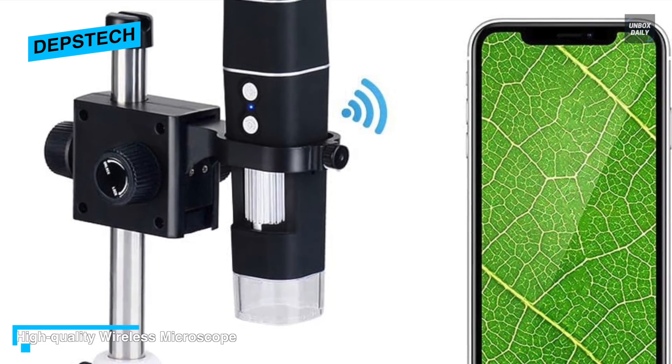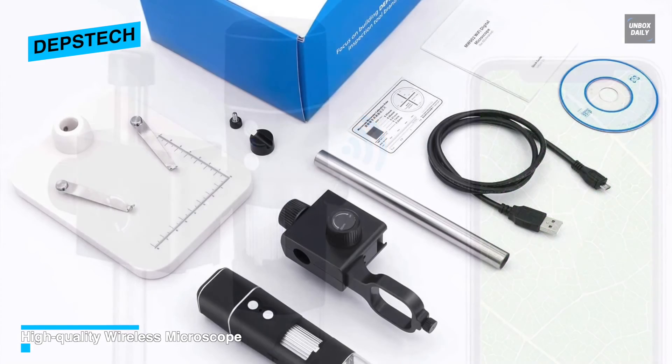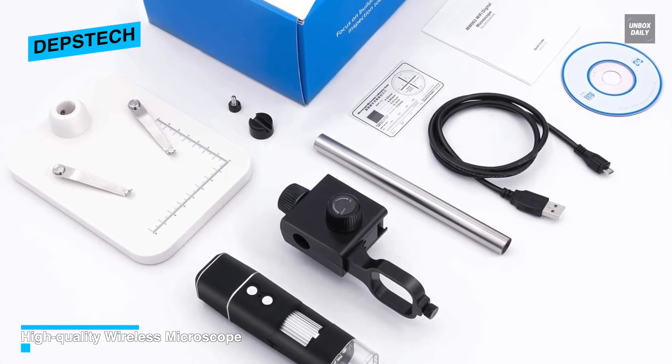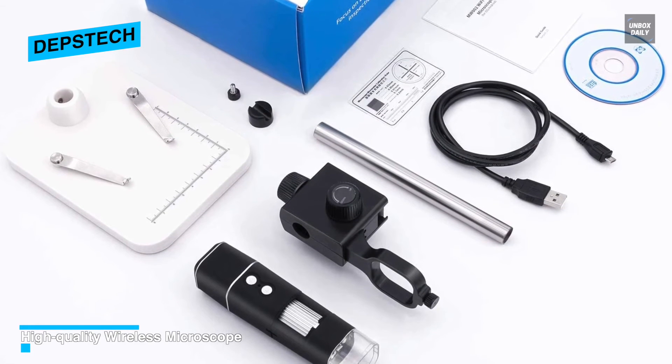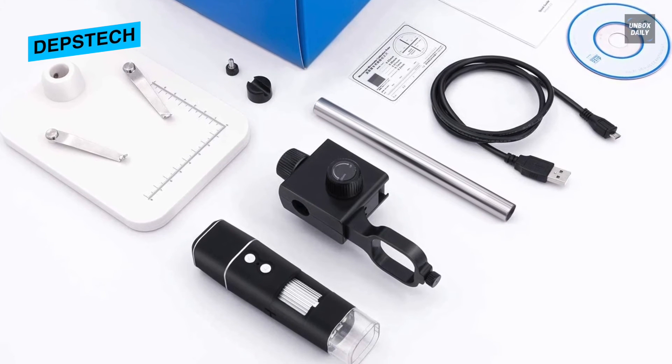The camera works to observe all micro structures and can be used for textile inspection, insect anatomy, school research for plant science, youth exploration, PCB board inspection, skin detection, identification, and more.